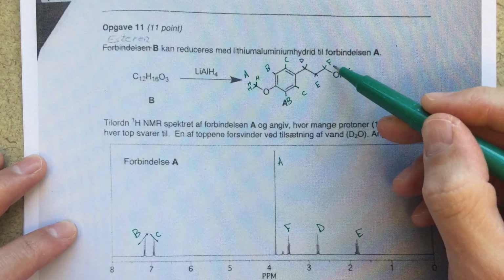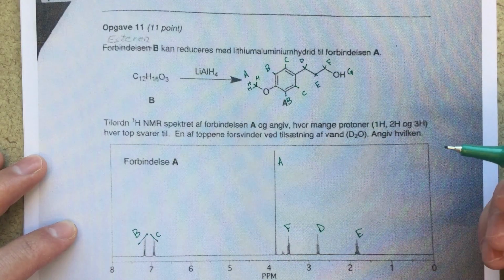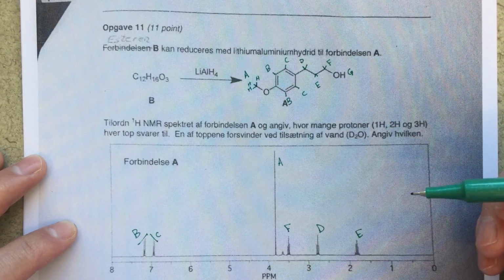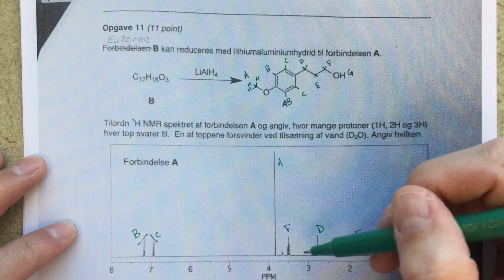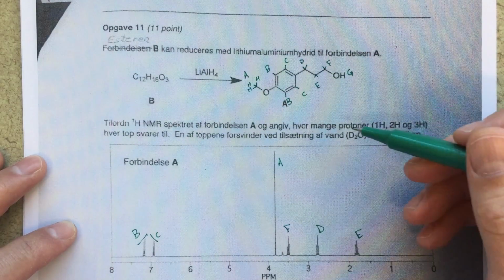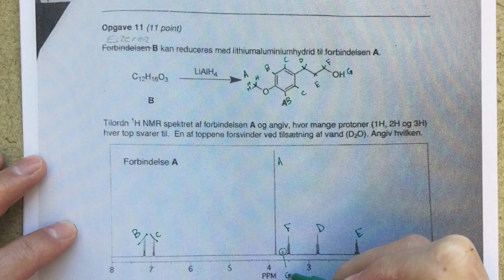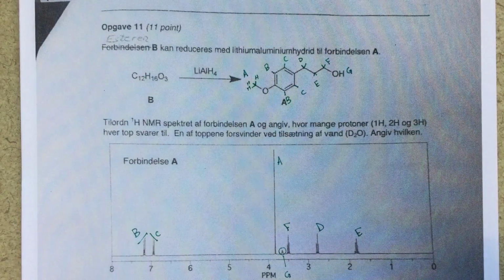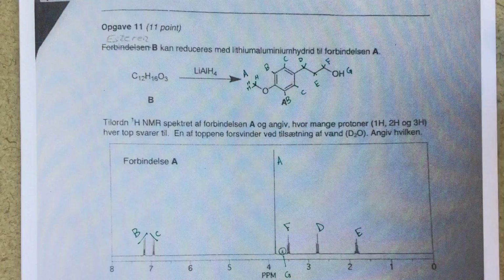And the reason I'm choosing that is because F is bonded to an oxygen. Again, that oxygen is going to be shifting it downfield. So now I've just got G left, which is this 1 high singlet. It's probably going to be broadened a little bit because it's bonded to the oxygen. We're going to get some exchange there, especially if we're in D2O. So this tiny little peak here, that's going to be my G. That's going to be my OH peak. Okay, so that's assigning this first spectrum, and I think that's a great exercise to do.